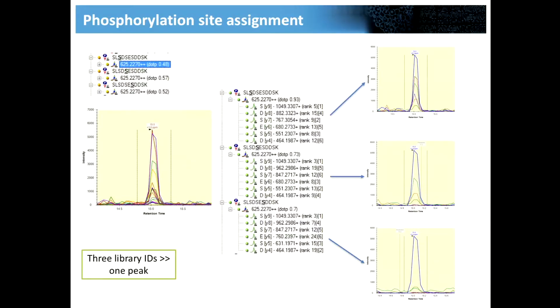So here I cherry-picked for you a few examples. We scrolled out, we looked at a couple of retention times, but now in a very big DIA SWATH data set, this is not going to be very realistic. So I bring up these points. Of course, we would have a lot of scores that could help us here, but only to highlight some of the challenges that we might have with site localizations.